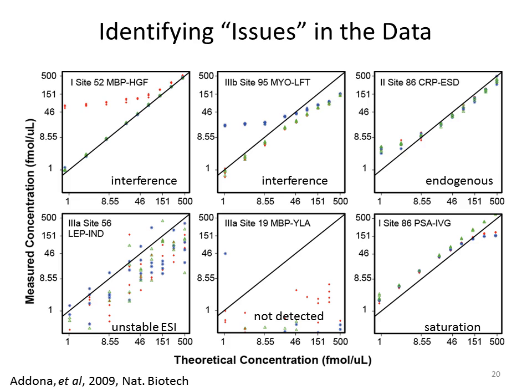So that's called endogenous. You're detecting endogenous levels of your targets. So CRP is present in plasma at reasonably high abundances. And so when we were spiking into it in our blank, we saw it in our blank too, but at the low level spike, it wasn't reading as a low level. And that's how we tell, because all 3 transitions track together, so you know it's the analyte.